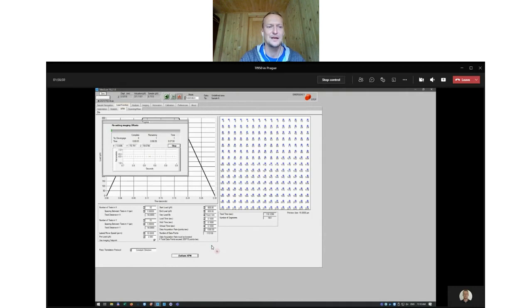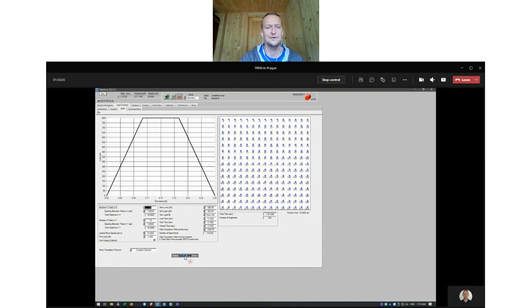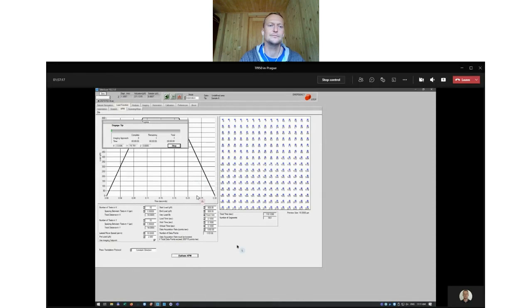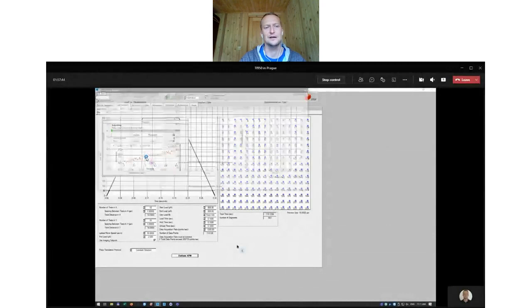So now the piezo automation finished, and so I can simply click here, perform XPM. And now we'll be mapping the same area that we used before for targeted indents. So I just click start, engage, yes. So now the tip is engaging to the sample. It will reach the contact point or contact set point of 2 micronewton. And then again, a piezo scanner will move to the first position, and we will run an indent in lines. So there is 45 seconds of cycling time, so I can skip that for now.